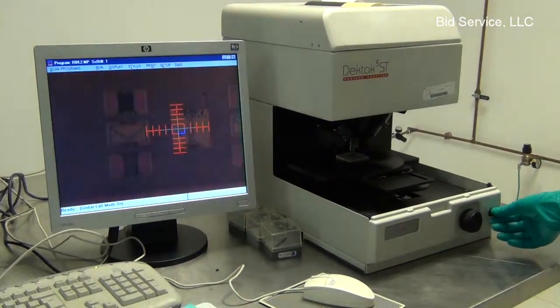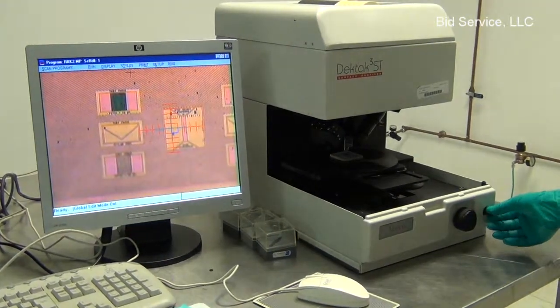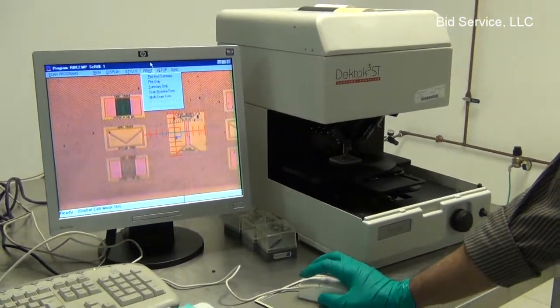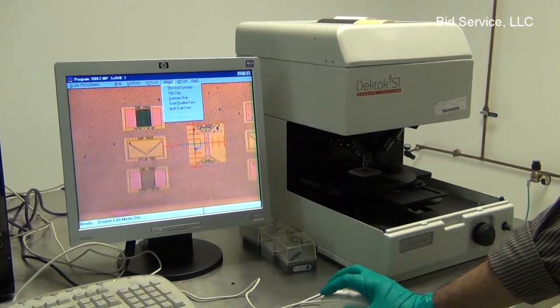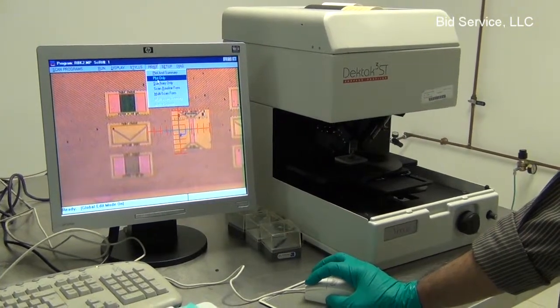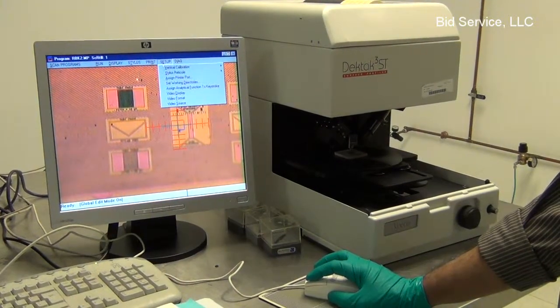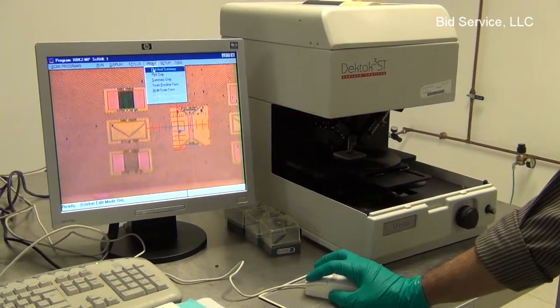The intensity of the lamp can be adjusted to get proper illumination of the pattern or the wafer surface. In the print menu, the plot and summary can be printed, or only the plot, or the summary only. And we can also print routine forms and multi-scan forms.